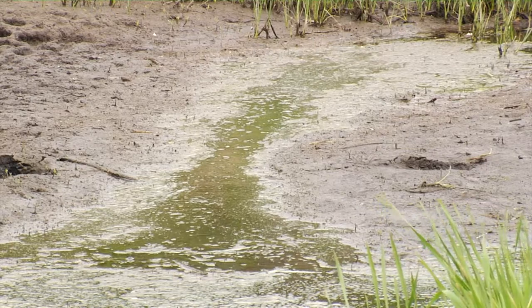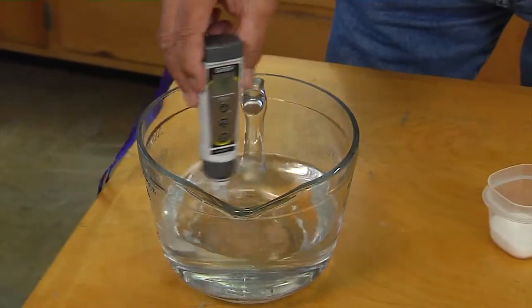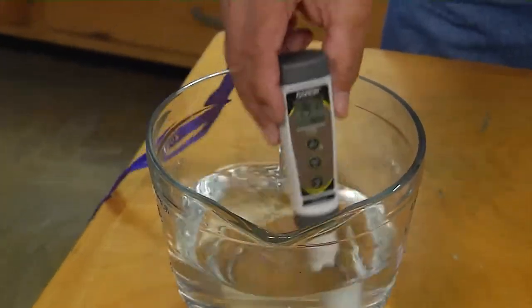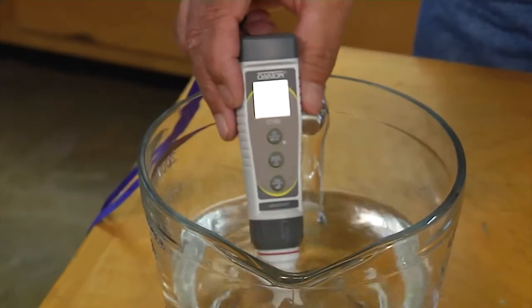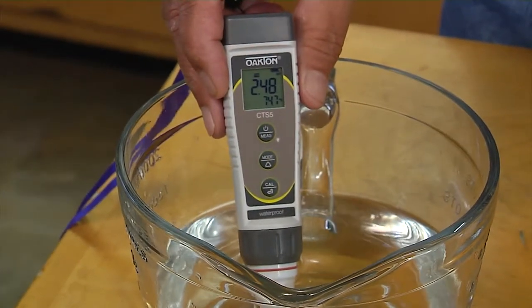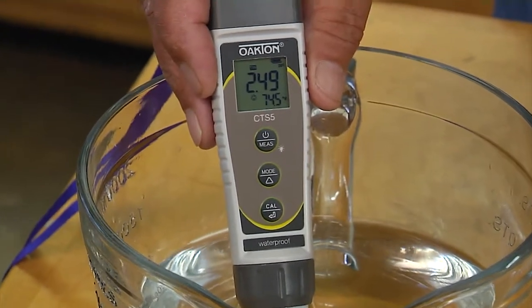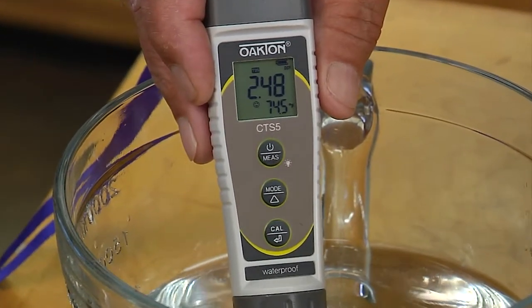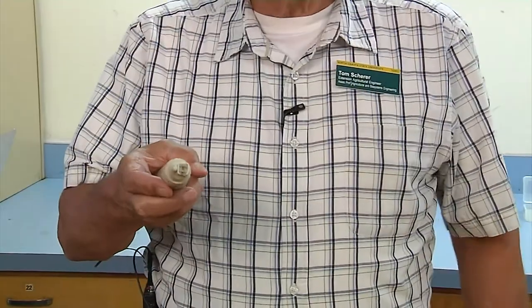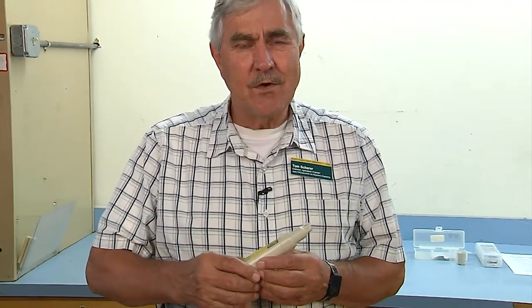So today we're just going to show an easy way to check an EC meter — electrical conductivity meter — to see if it is reading appropriately to measure water supplies out in the environment. We're going to be using handheld EC meters that measure electrical conductivity of the water. More minerals in the water means it conducts electricity more easily, and therefore there's a relationship between EC and the total dissolved minerals.